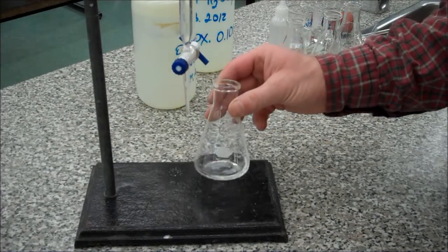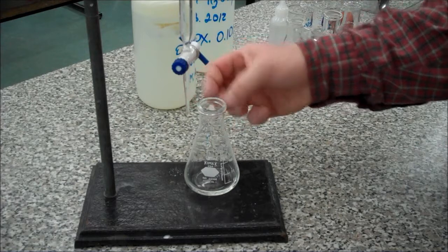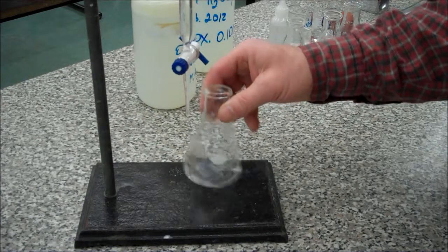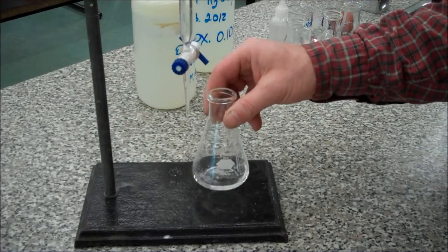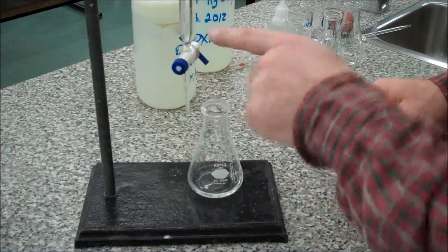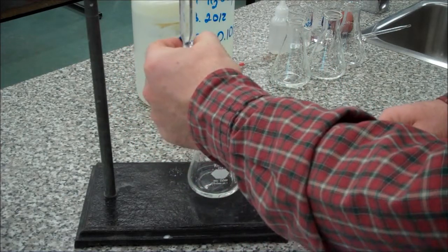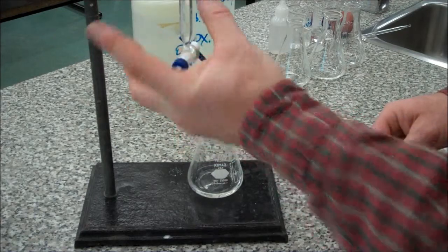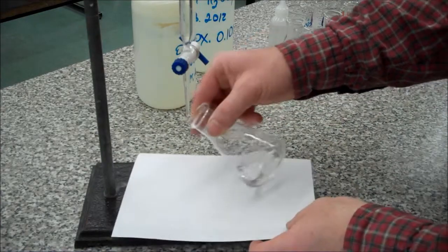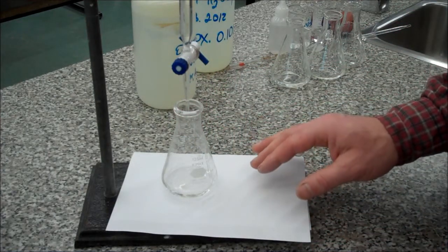So this is our sample. It has 1 drop of phenolphthalein in it. You must have that, otherwise it won't work. You want the tip of the burette about 1 centimeter below the rim of the Erlenmeyer flask. I'm right-handed, so I'm going to hold the Erlenmeyer flask in my right hand and swirl it the entire time I'm doing the titration. Since I'm using my left hand to control the valve, I want the valve handle on the right-hand side. I'm going to reach around the barrel of the burette with my thumb on the white part and my 2 fingers on the blue part of that handle. And if you put a piece of white paper, which is going to be waste, it might have drips of fluid on there, so we're going to have to throw that in the garbage later. It'll just show up the indicator better.